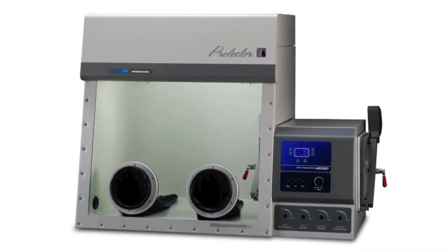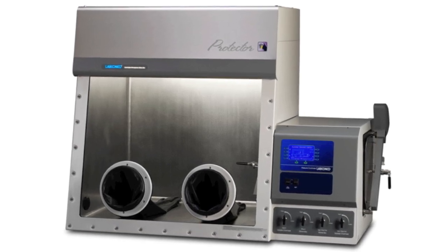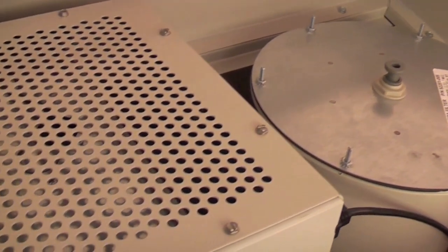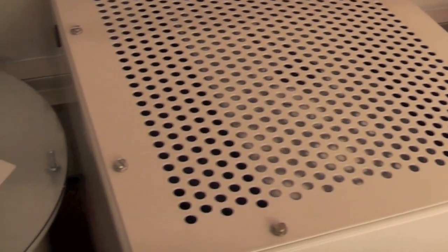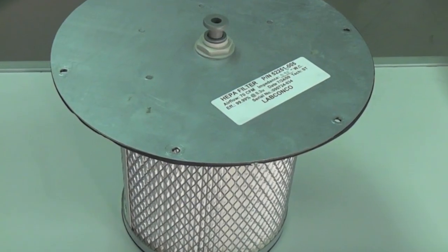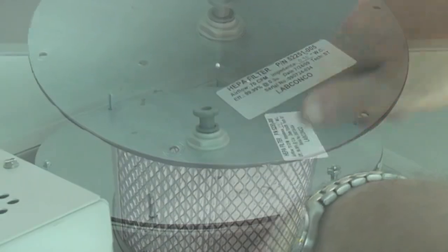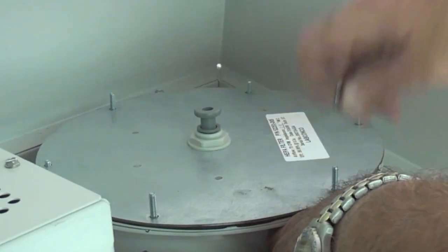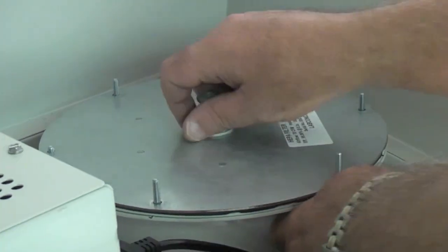Protector filtered glove boxes feature fiberglass or stainless steel liner options. Fiberglass boxes have inlet and outlet HEPA filters that are 99.99% efficient on 0.3 micron particulates. Stainless steel boxes have inlet and outlet ULPA filters that are 99.999% efficient on 0.12 micron particulates.